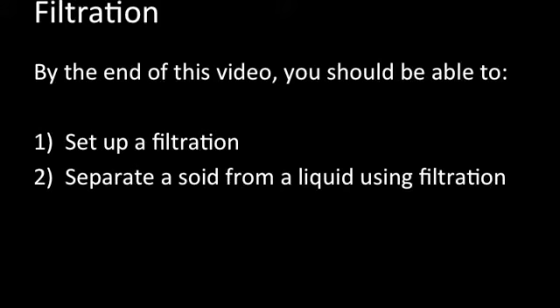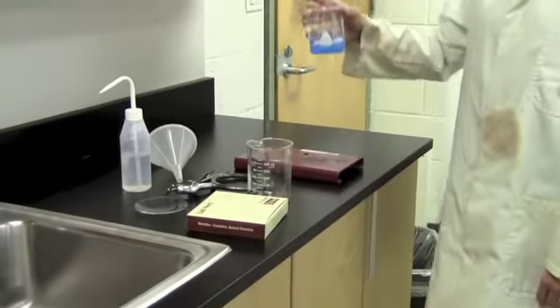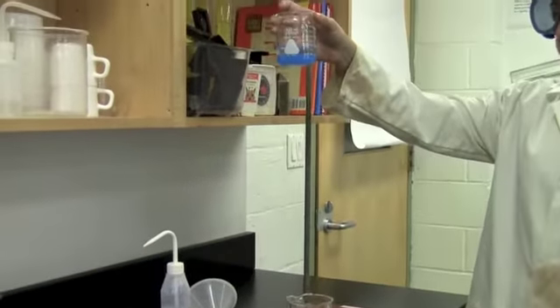Filtration. By the end of this video, you should be able to set up a filtration, separate a solid from a liquid using filtration, and determine the mass of a solid recovered via filtration. We usually use filtration to separate a solid from a liquid, sort of like this.